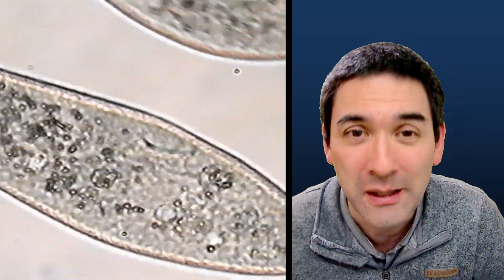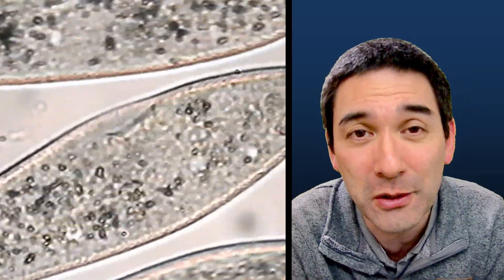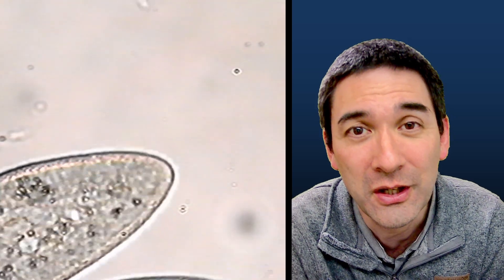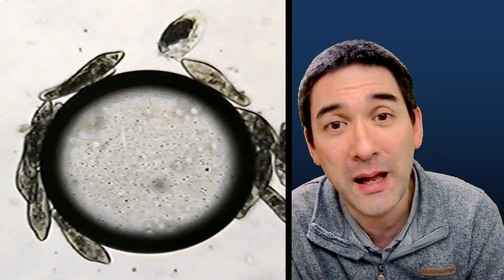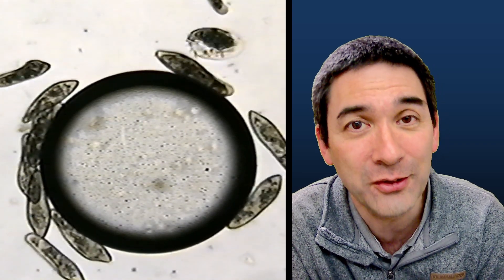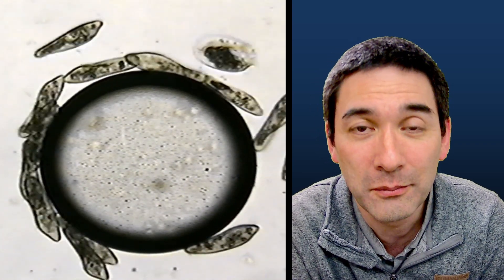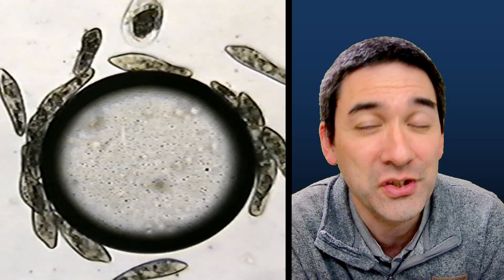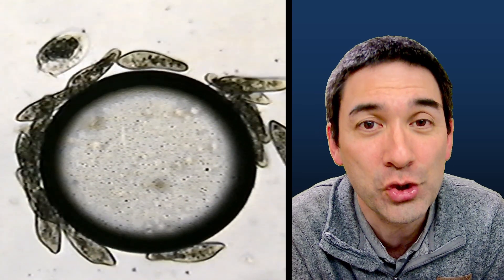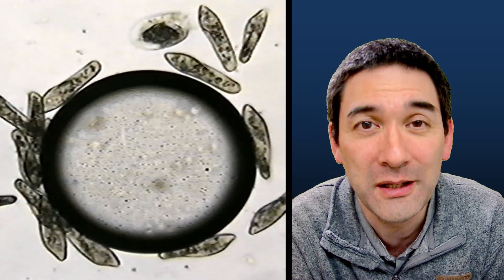So the water is moving from an area of lower salt concentration to an area of higher salt concentration, which is the surrounding medium. I was able to see that those paramecia actually started to lose quite a bit of water. Here those paramecia have gathered around an air bubble because they like to do that, as these microbes need a lot of oxygen.